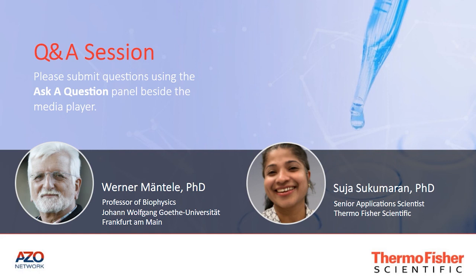Here's another question, from one of the audience members, who says: I use IR spectroscopy a lot for chemical analysis. Normally I use the routine KBr pellet sampling technique. Can I also use this standard technique to analyze protein samples? I would not recommend that.